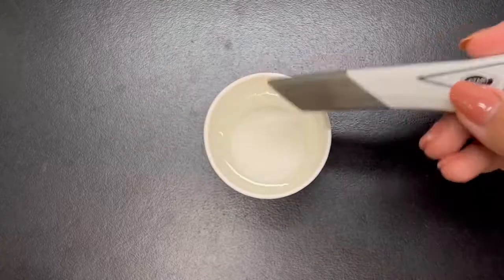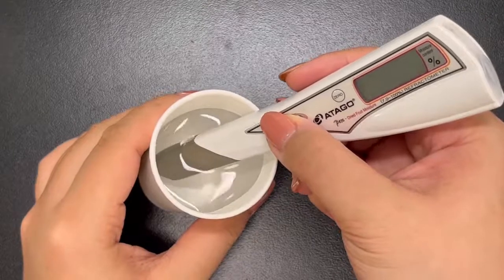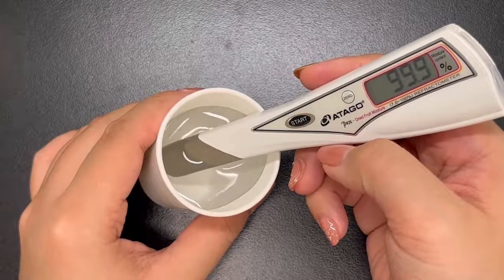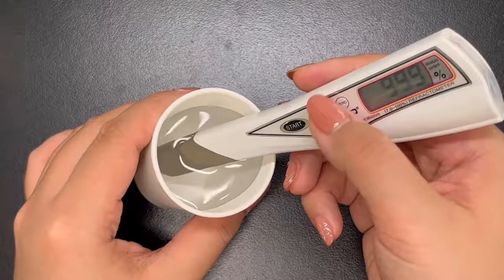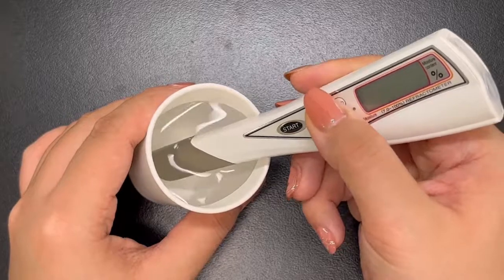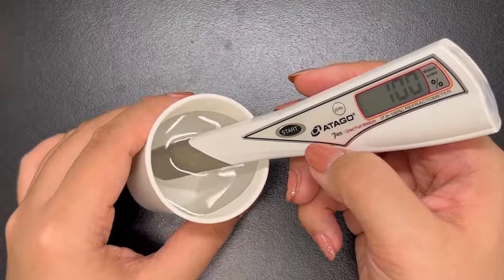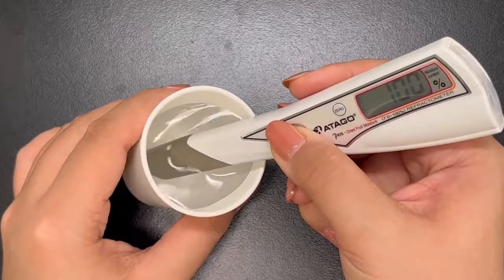Now let's see the zero setting for the PEN Dried Fruit Moisture. As you can see, the PEN is different from the PAL — you need a bit more water for zero setting. It's the same in that you press start, but the PEN has a continuous measurement mode, so it keeps measuring continuously. Press and hold the zero button for about a second, and once it shows 100, the zero setting is done. When you want to stop the continuous measurement, just press start once and it will stop measuring.